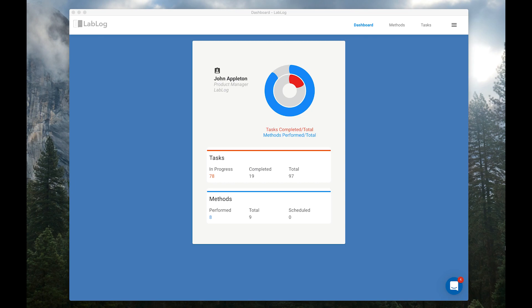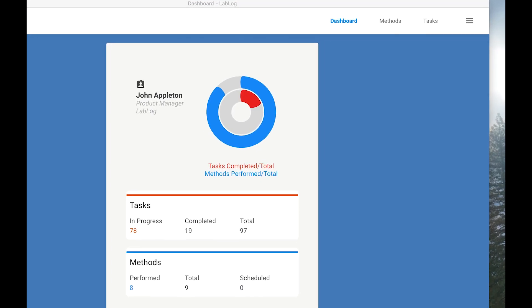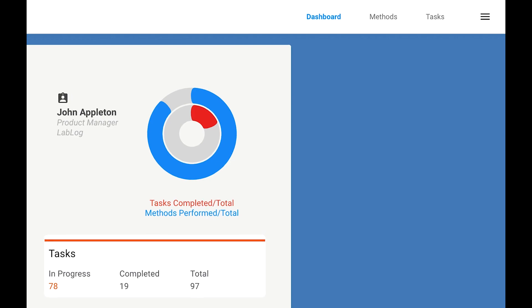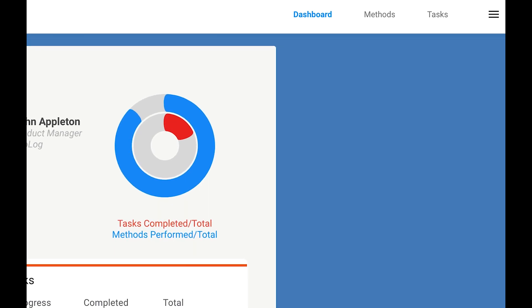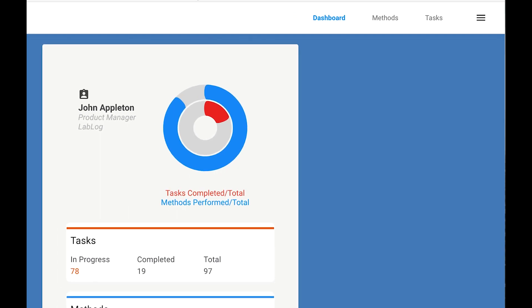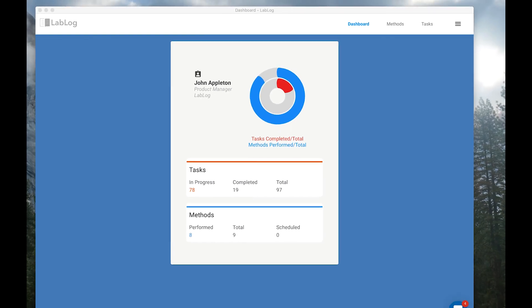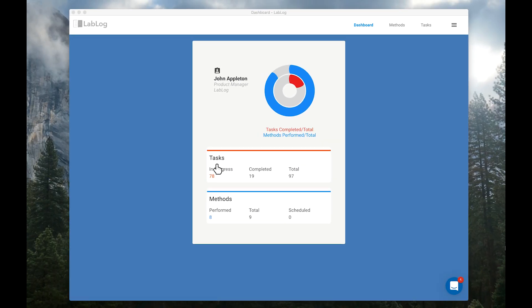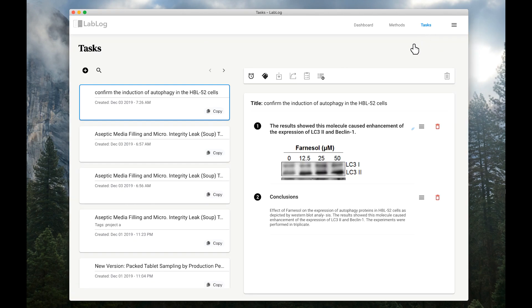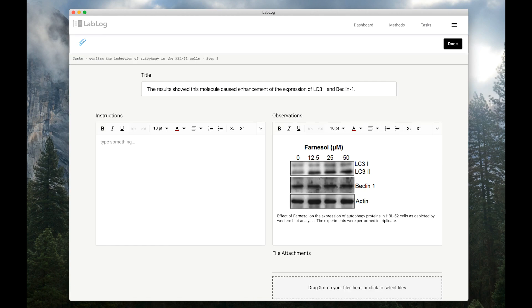What's different about LabLog is that your notes are organized into methods and tasks. You can record your experiments, create protocols or standard operating procedures, and collaborate. Anything you like, FDA Part 11 compliance is automatically taken care of for you.